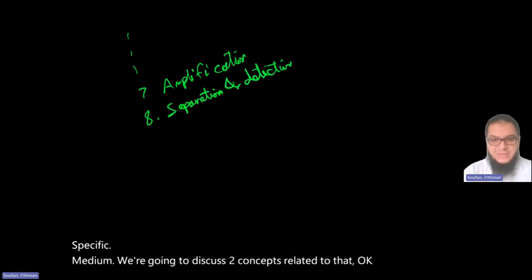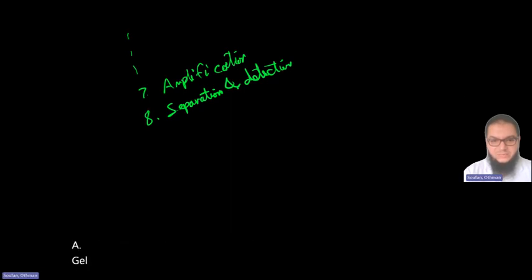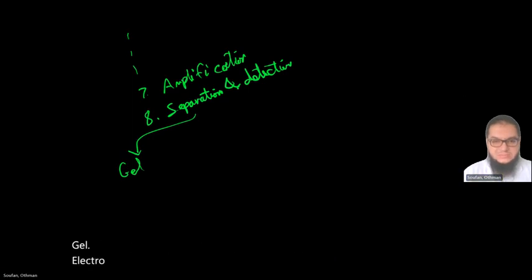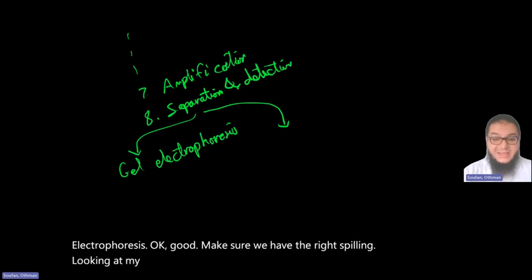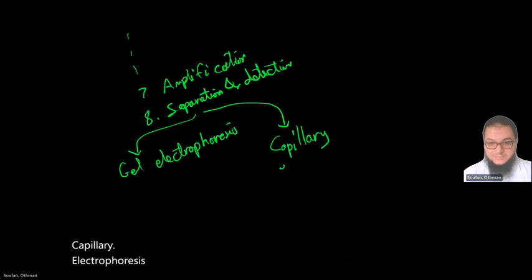One of them is gel electrophoresis, and the other is capillary electrophoresis. Let's put this here for short.